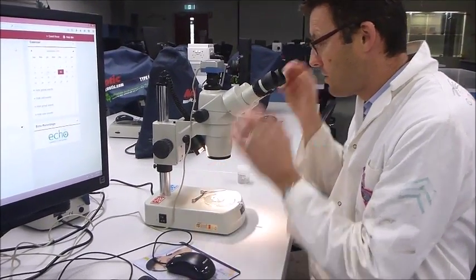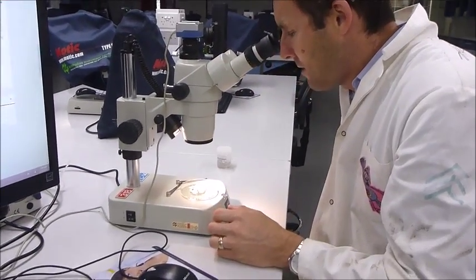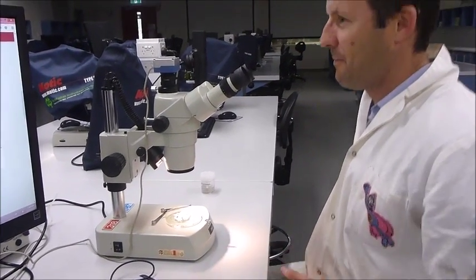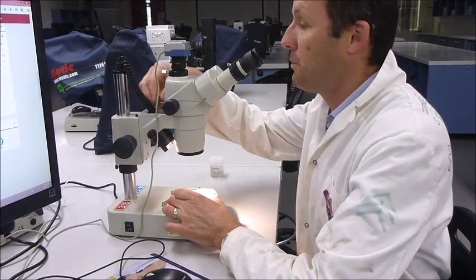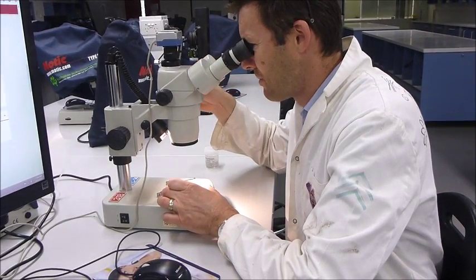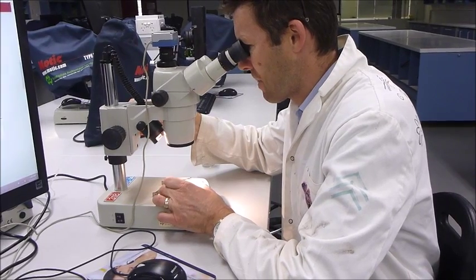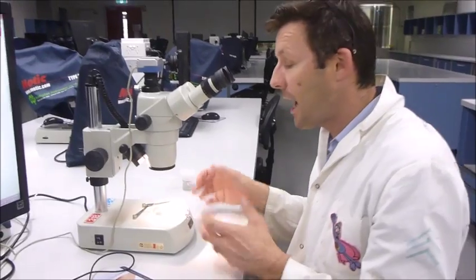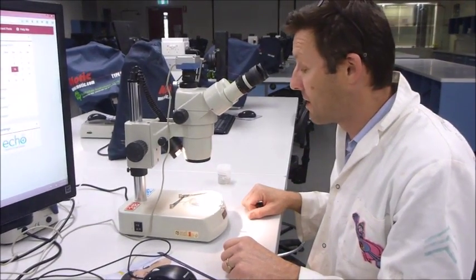and the first thing I can do in looking through the microscope is I want to get to the point where I can identify all the bugs that I have in my sample. So the first thing is to separate them into morpho groups. So put them in groups of things that you think are the same, and separate them around your petri dish with forceps. Once you've separated them into their morpho groups, you can start working to identify them.